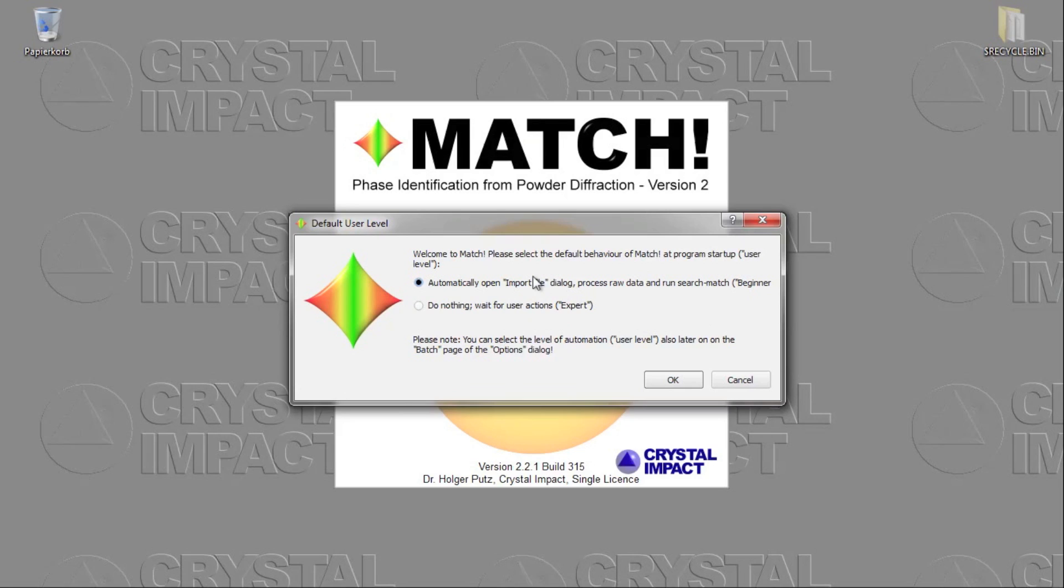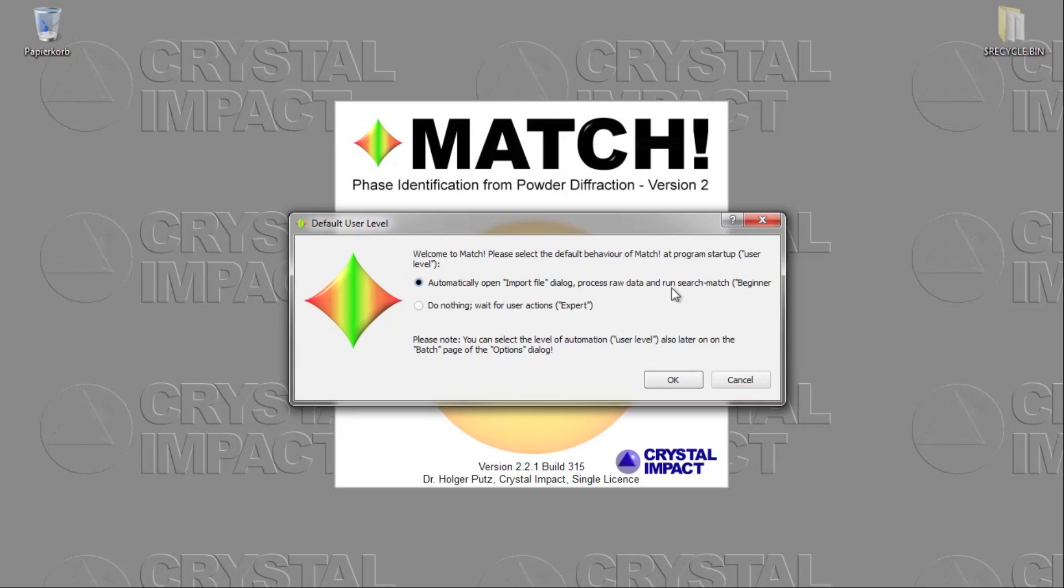When you start Match for the first time, you will see this window asking what you would like Match to be like concerning the automatic processing of the data. There are two options. Basically, you can let Match do most of the calculations automatically, or as an alternative, you can run all actions and calculations on your own.